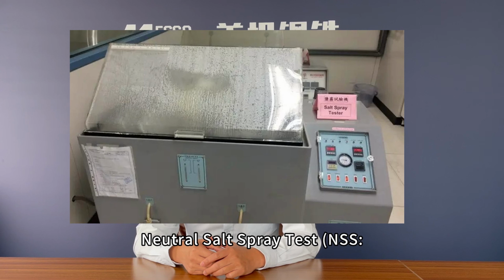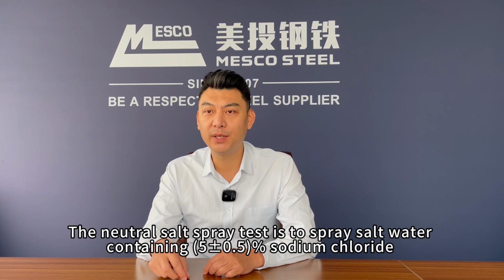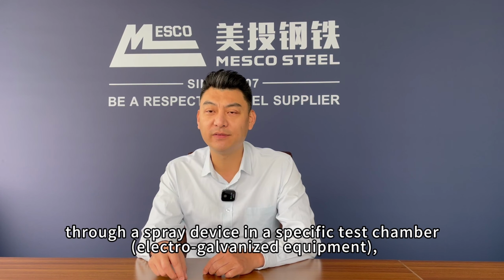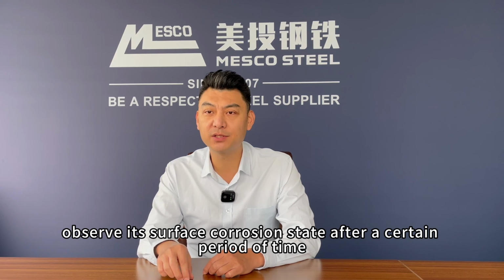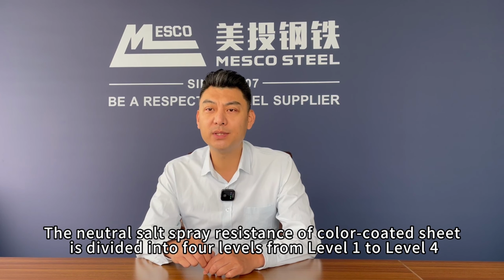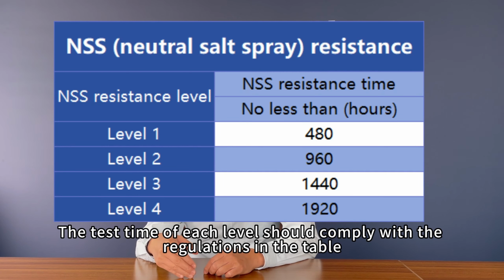Corrosion resistance measurement. Neutral salt spray test. The neutral salt spray test is to spray salt water containing sodium chloride and a pH value of 6.5 to 7.2 through a spray device in a specific test chamber, allowing the salt mist to settle on the surface of the sample. Observe its surface corrosion state after a certain period of time. The neutral salt spray resistance of color-coated sheet is divided into 4 levels, from level 1 to level 4. The test time of each level should comply with the regulations in the table.